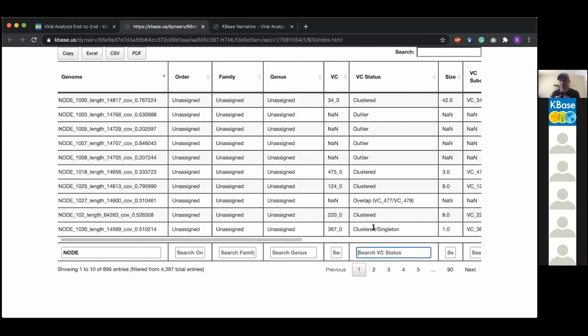So we split that up to say, hey, you were clustered, but at what ICTV defines as part of that genus, you didn't make the cut. So we're taking you out, and there were no other members for you to associate with, so it's not a subcluster. So sadly, you were a singleton.